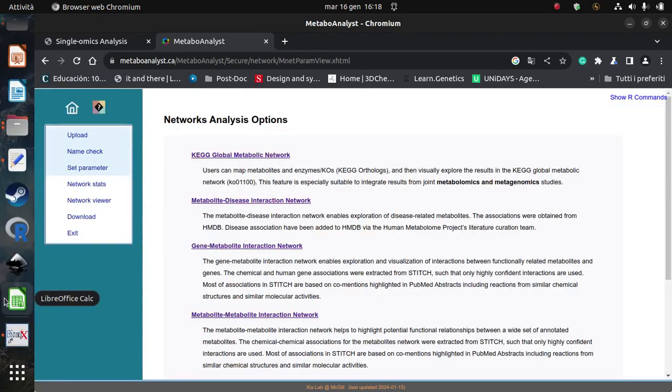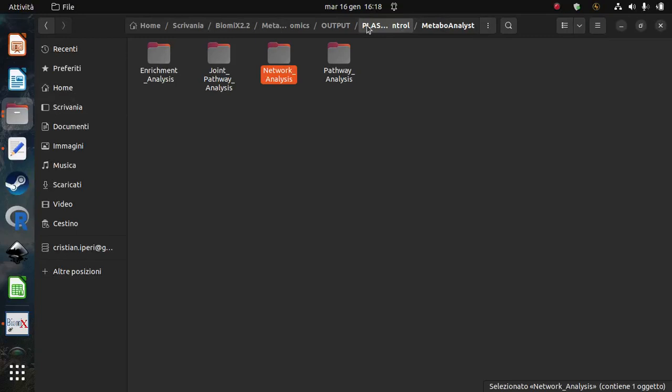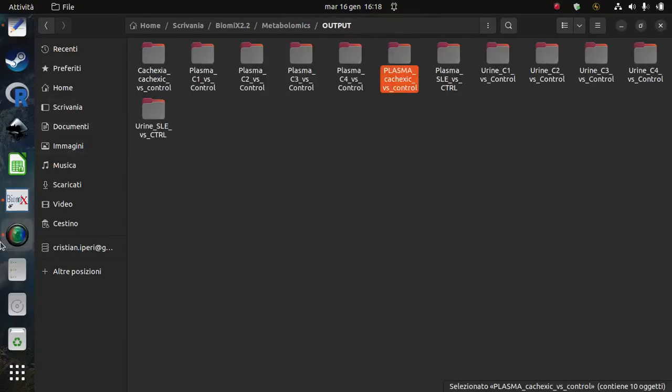Okay, so that has been an example. I hope it was kind of nice. The result, I show you the results. So I stop 1 second.